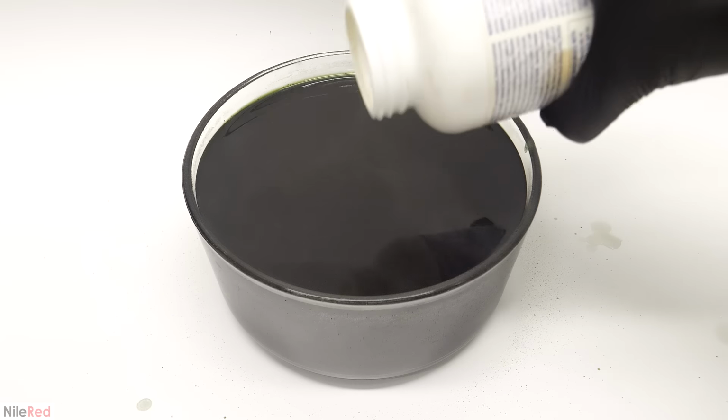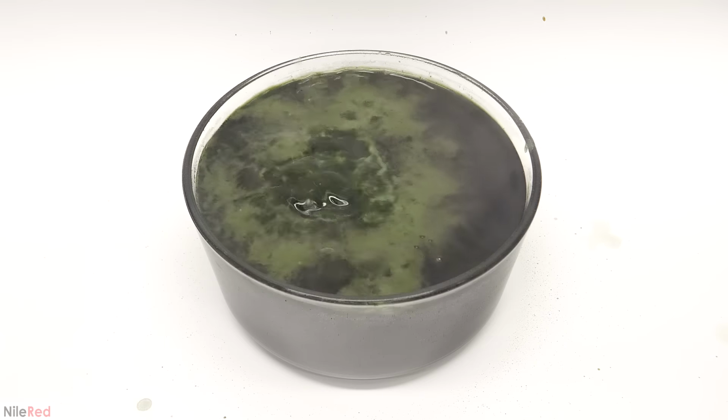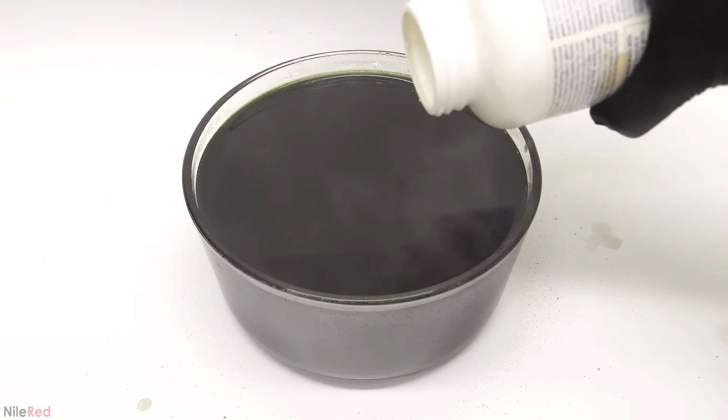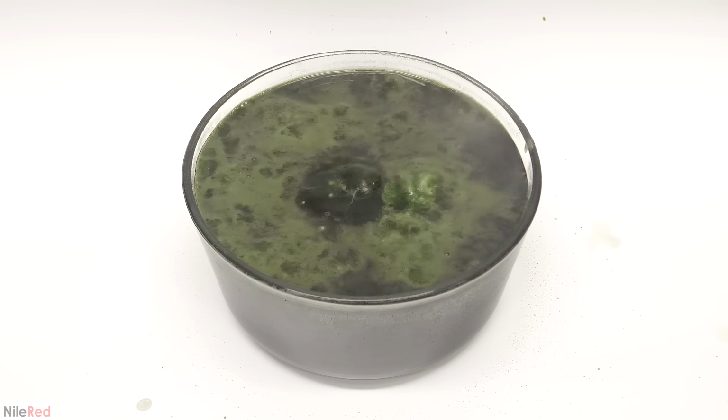This usually just happens in the area around the hydroxide though, and you can hear the faint rumbling sound that it made. However, as more was added, things got hotter and hotter, and eventually, a lot of the water started boiling as well. This was a pretty solid warning sign to stop and to wait for it to cool down, but I was curious to see what would happen if I kept going.